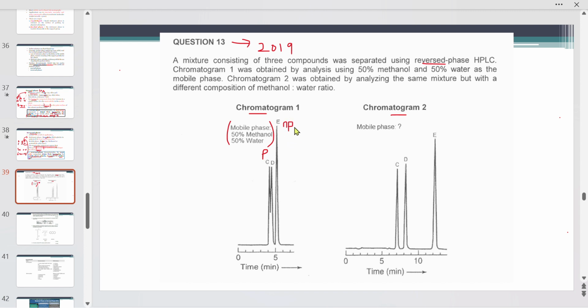So as you can see here, the non-polar analyte elutes faster than you want it to, which is why it overlaps with the polar analyte. This means that this mobile phase is non-polar. That is why it follows the mobile phase and becomes overlapping. So how do you make the retained component, the non-polar analyte, stay in the stationary phase and take its sweet time to be separated? You can do it by increasing the mobile phase polarity.